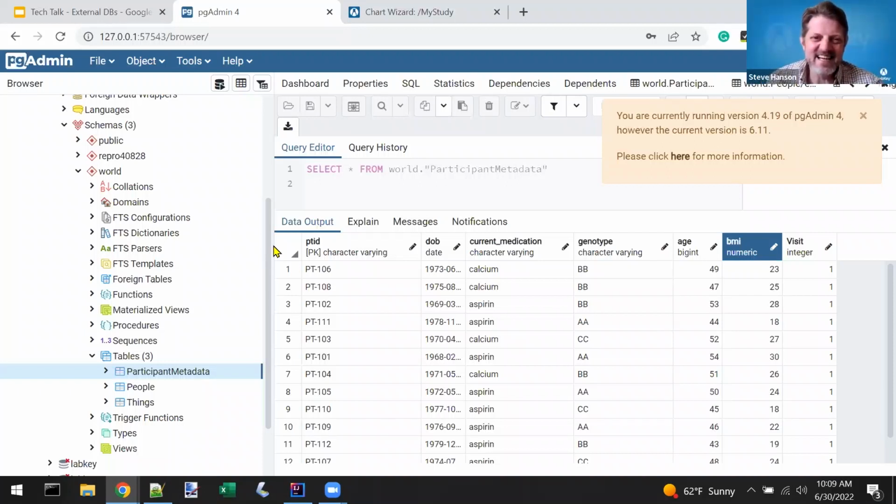Another question is, is it possible to import a selection of rows from a table? Yeah, I think it is. I bet you could create a view inside a database. ETLs are different, he said import specifically. Sure, so in the copy case, we don't actually copy directly from tables. We copy using a query over the table.